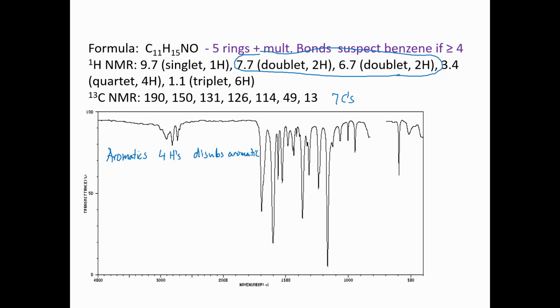Excuse me. Okay, what else can we say here? All right, what's our other aromatic, or what's our other unsaturation? Here we see the most unique peak of all, and that is the peak for an aldehyde. This is the only type of proton that comes at 9.7. If you're given an unknown of this type and the person asking you the question gives you an aldehyde, you really should say thank you, okay? Because it's the most unique type of signal there is, okay?